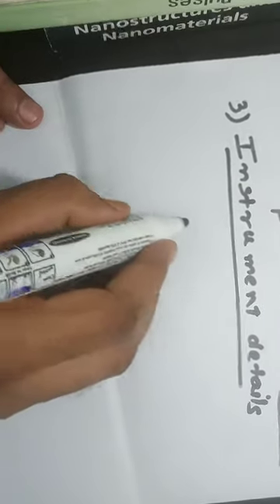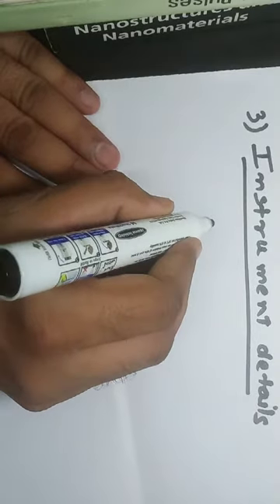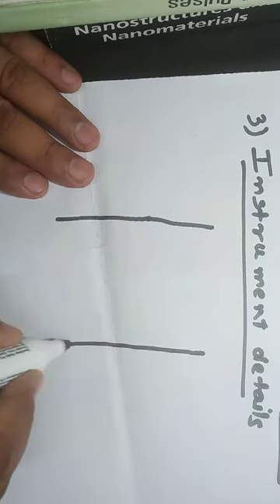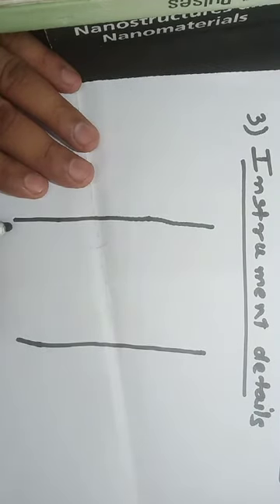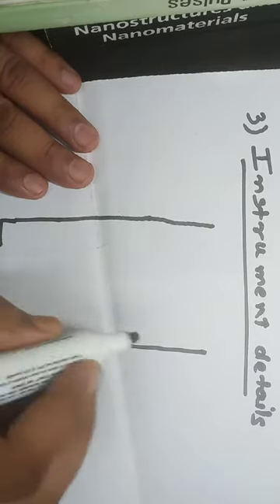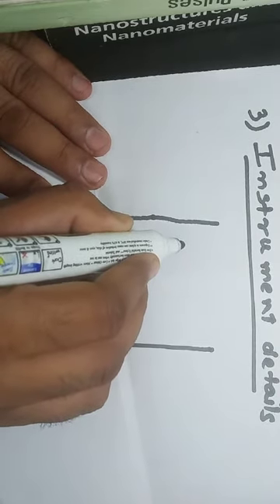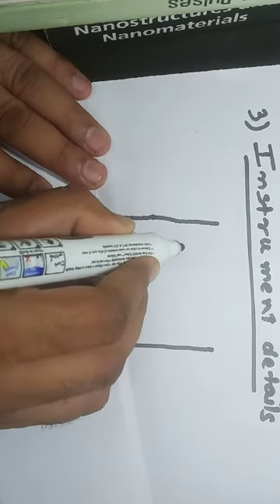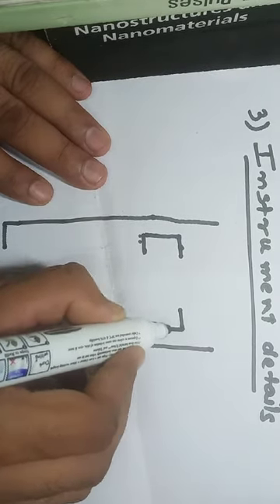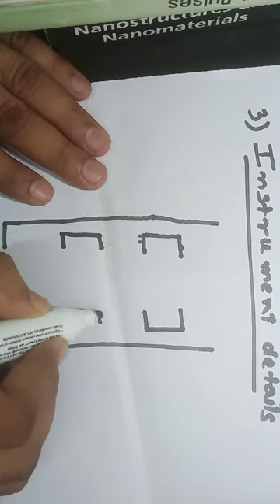So in this case you would have an electron source. Let's say we have this type of chamber, and in this chamber we would have all the details which are responsible in this case. The first would be here you would have the first lens, and then here you would have the second condenser lens.